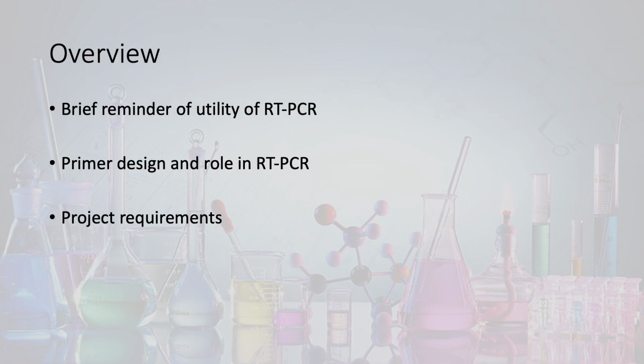So just as a reminder, or an outline for this short pre-lab lecture, I'm going to remind everyone about the utility of RT-PCR, right? What does it measure? How does it measure that? Very briefly, if you need to familiarize yourself with the topic, you can review the RT-PCR overview at large.